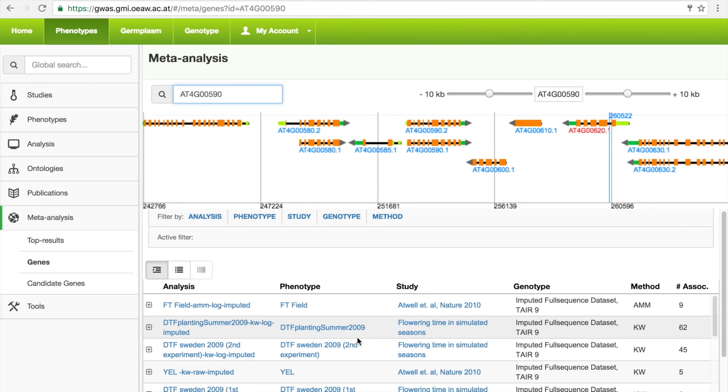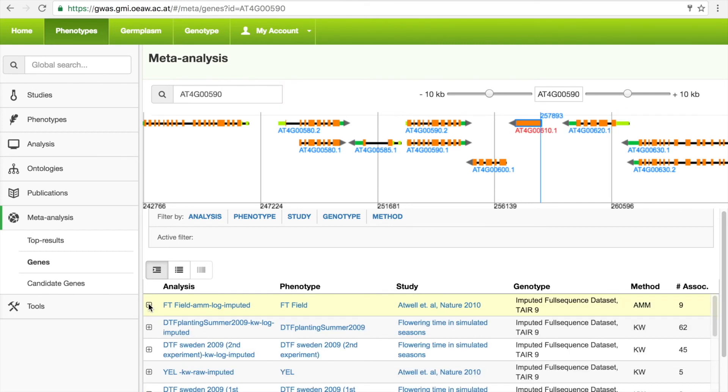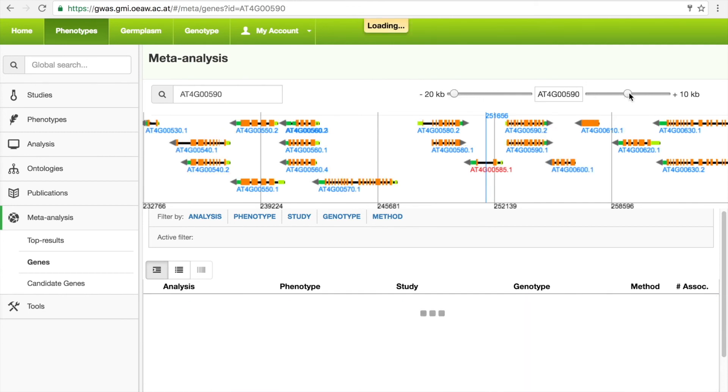As GWAS studies often result in broad peaks, other associations from individual studies can be displayed by expanding the study of interest. The region of interest can also be changed using the sliders, and the list can be completely expanded if necessary.